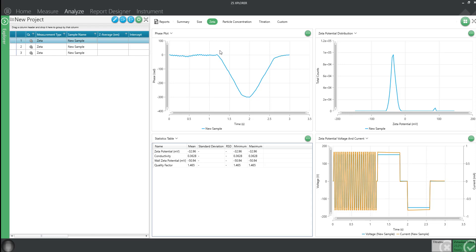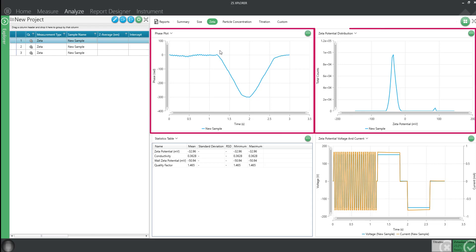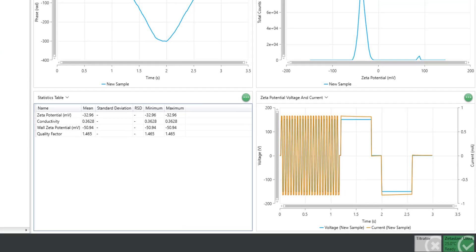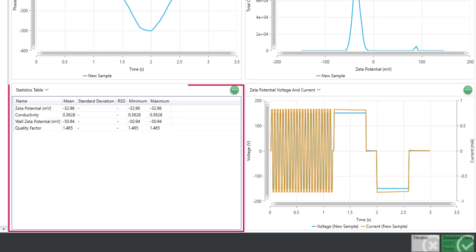Here you can see the phase plot, zeta distribution if it was measured, and a statistics table showing results.